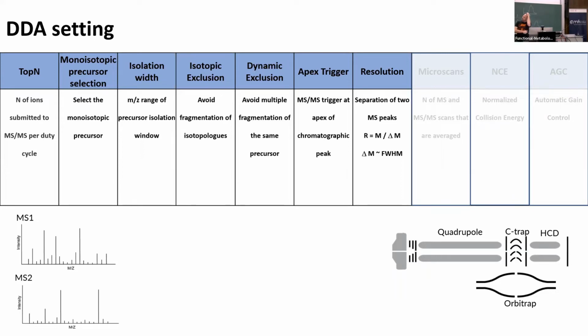So you say, okay, at this resolution, it scans at that speed, plus my fill time for the C-trap, what would I end up with at the maximum HCD fill time? And then go from there. And then depending on the chromatography you use, have it appropriate.